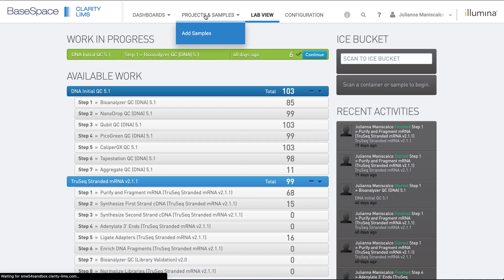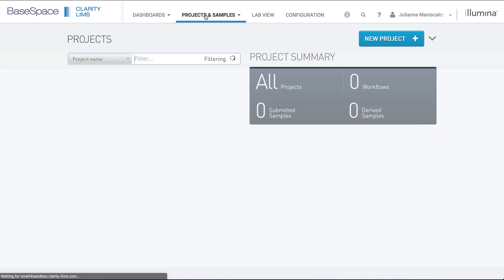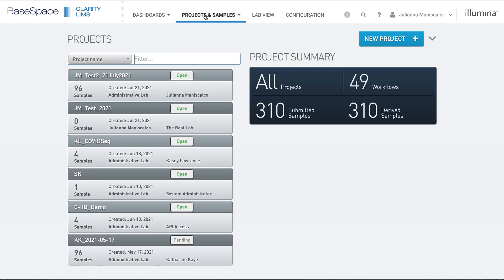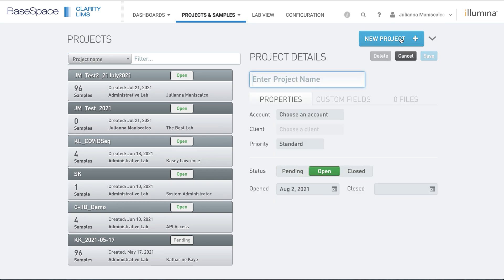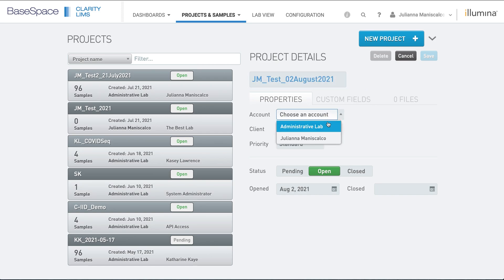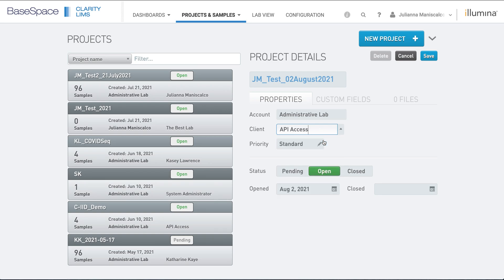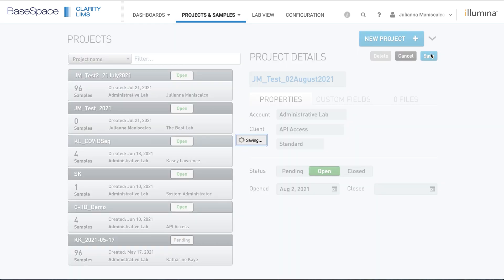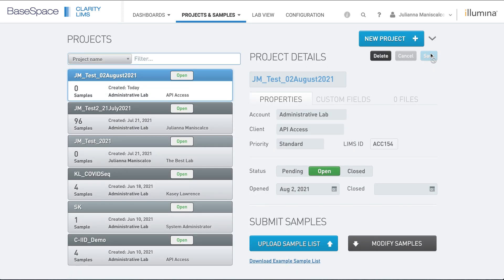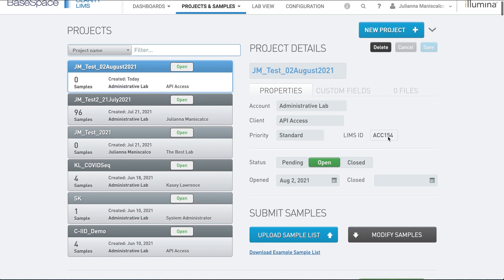From the Projects and Samples screen, you can create a new project by clicking the blue New Project button. You will need to give your project a name, an account, and a client. Once the mandatory fields are entered, you can click Save. You will then see your project appear on the projects list on the left-hand side.